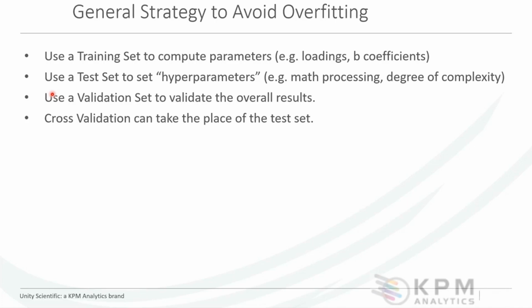These include things like math processing that we will do on our spectra, on our raw data coming in. It also looks at the degree of complexity, the number of factors. We will then use a validation set to evaluate the overall results.